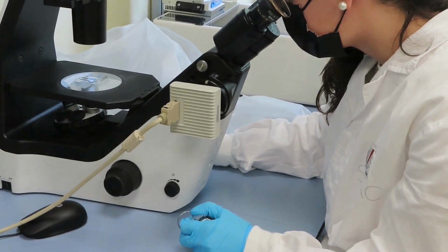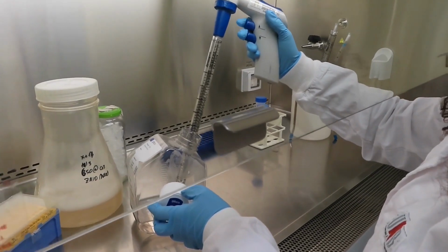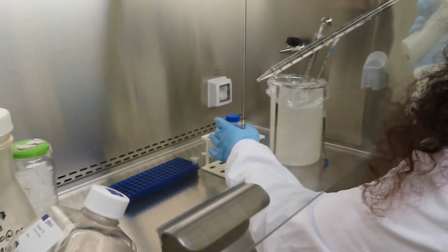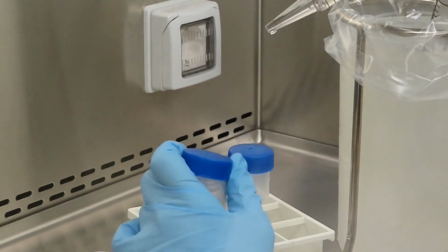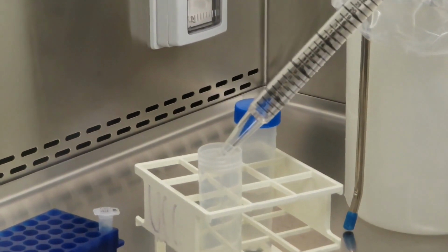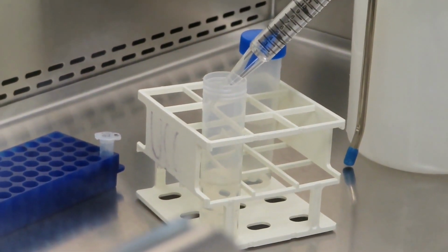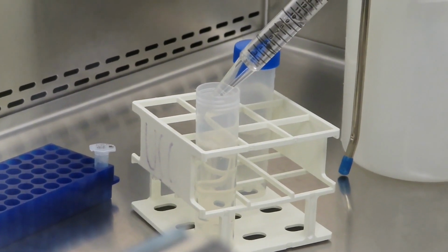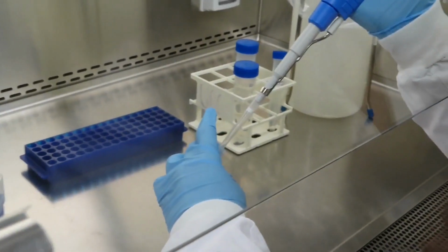Once checked that the culture has the appropriate concentration of apparently undamaged cells, the transfection procedure can be started. A transfection mixture must be prepared in a volume representing 1/10 of the total final culture batch. This means that, for example, in this particular case, half a liter of final culture is composed of 450 milliliters of cultured cells plus 50 milliliters of the transfection mixture.